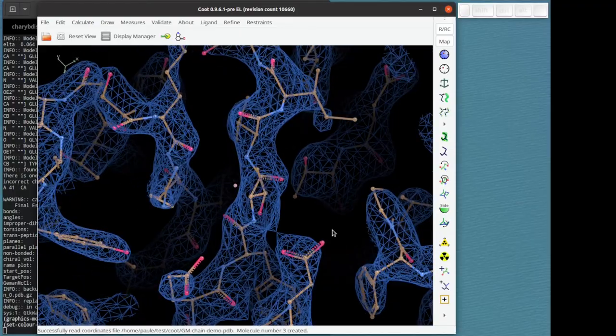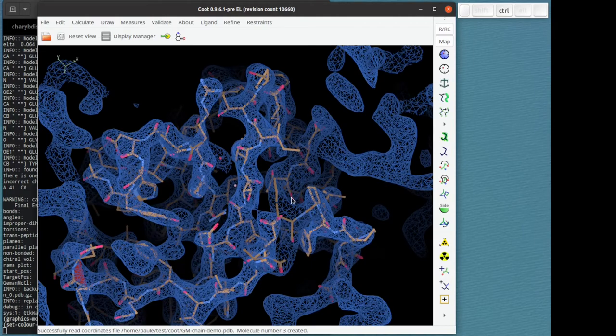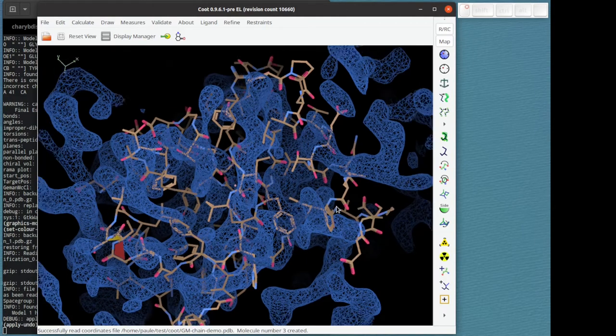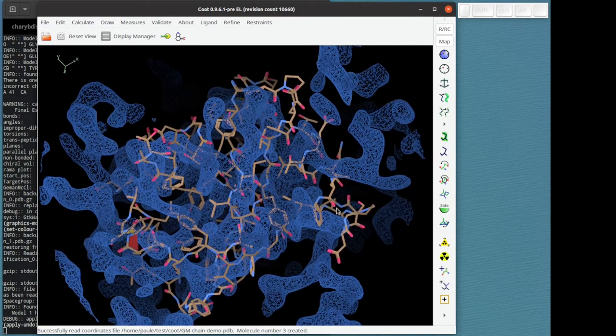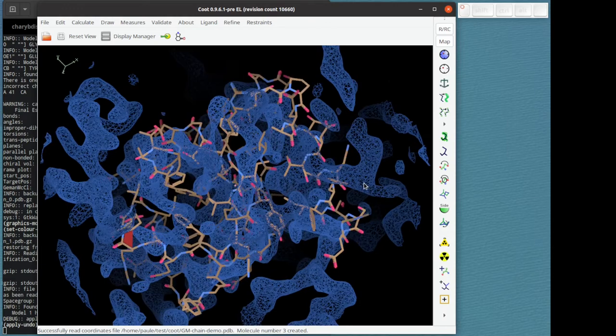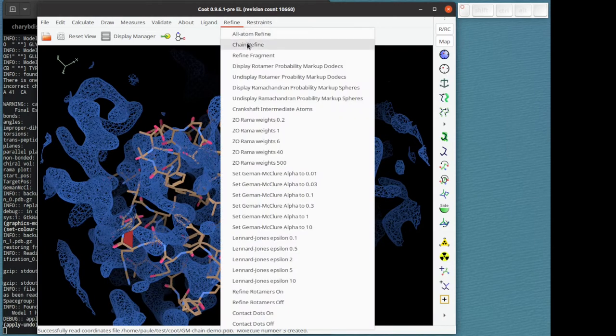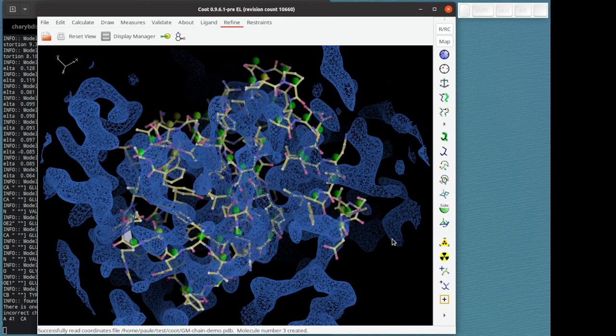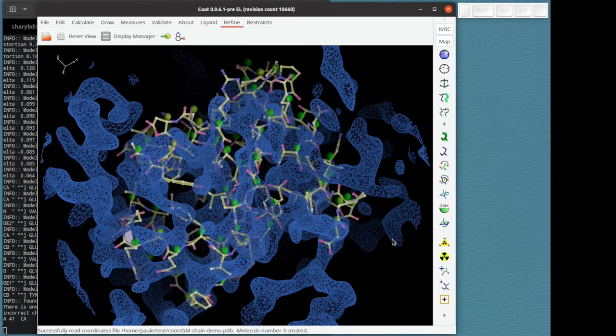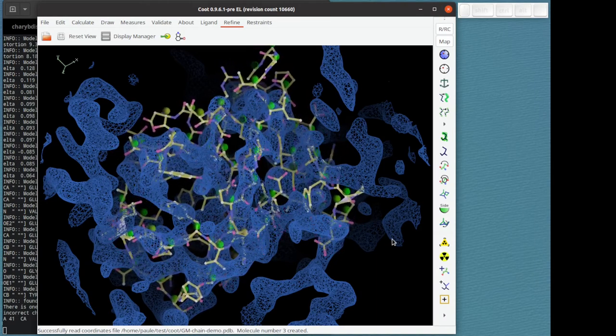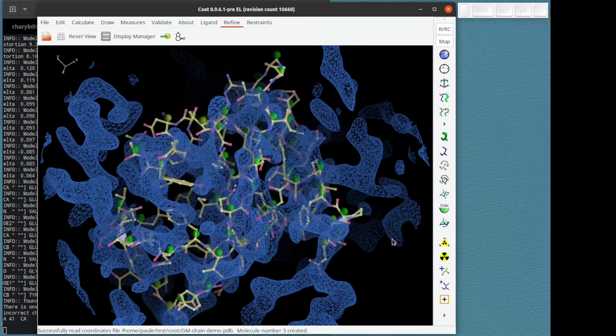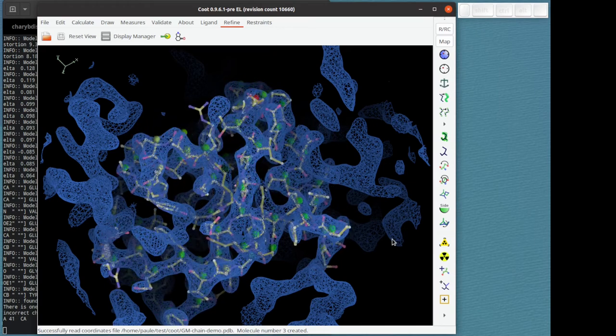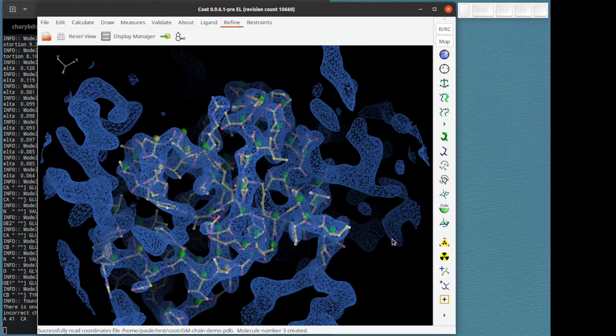I'm going to press ctrl z so that we go back, and I'm going to demonstrate that again with all atom mode. It looks slightly different. Refine chain refine. You can see it more clearly perhaps swishing and swaying and deforming as the refinement goes on. You can see that there's local changes that are happening. It's not a rigid body.